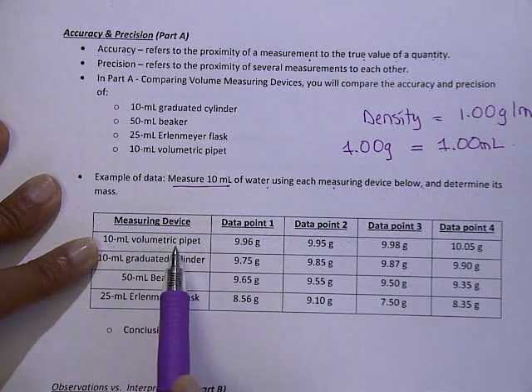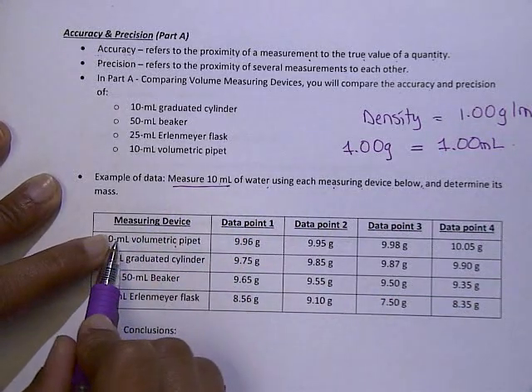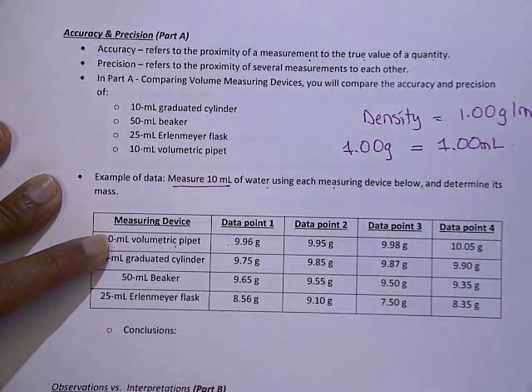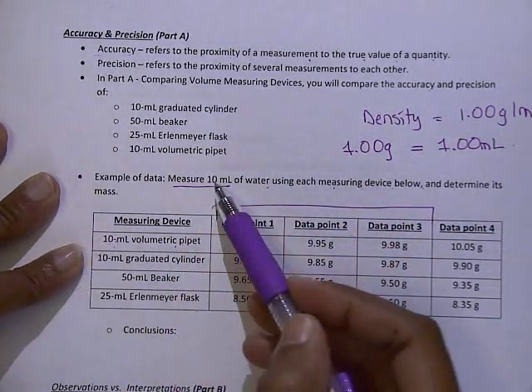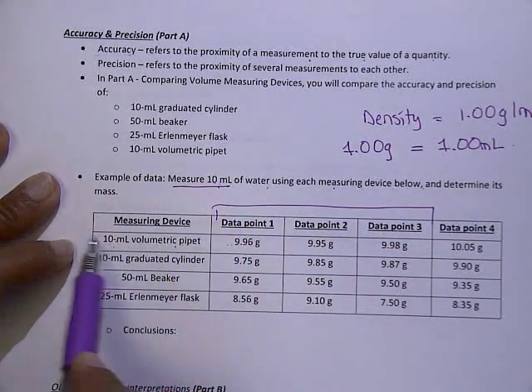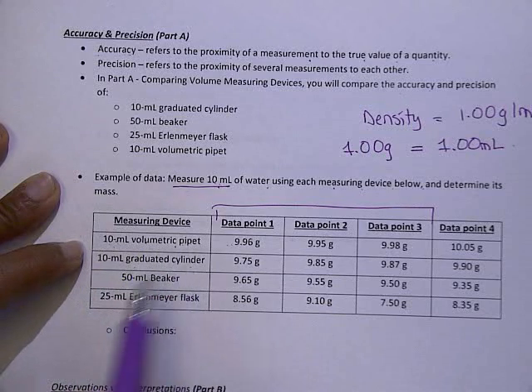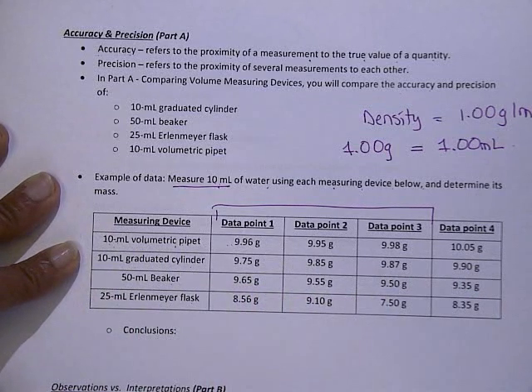So you're going to use a 10 milliliter volumetric pipette, measure out 10 milliliters of water, and then weigh it out. You're going to do this several times according to what your lab manual says. Your lab manual actually says to just measure it 3 different times. So each time you're going to measure out 10 milliliters of water using a volumetric pipette, a graduated cylinder, a beaker, or a 25 milliliter Erlenmeyer flask, and then weigh them out.